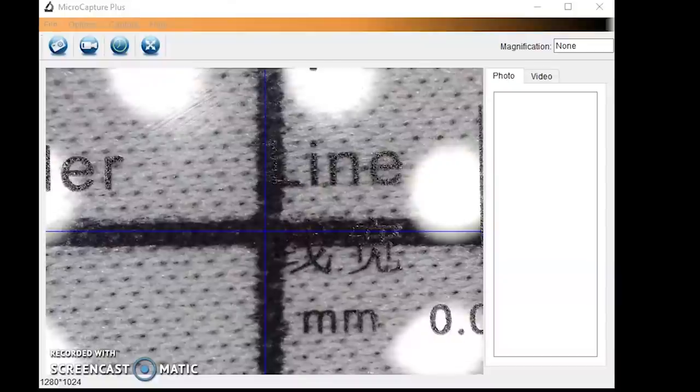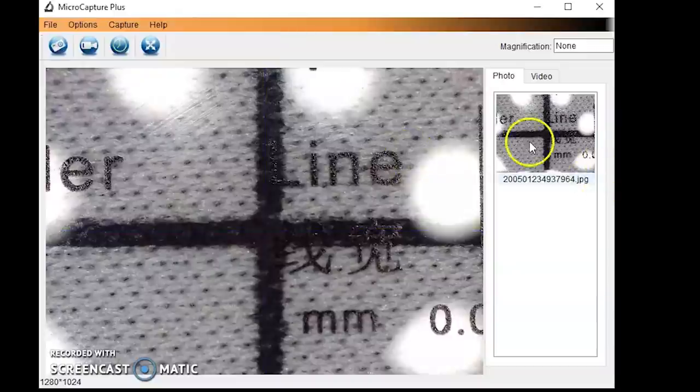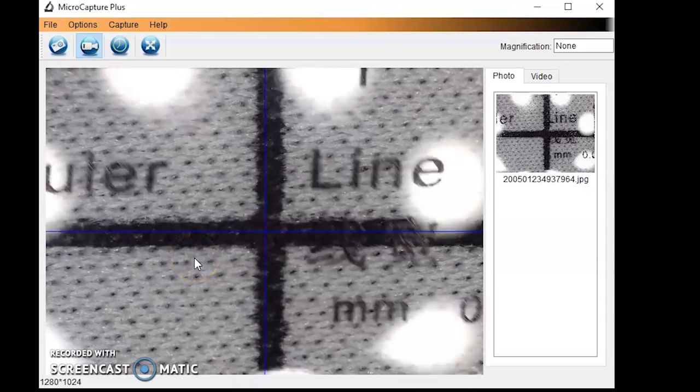As far as the software is concerned, I'll show you a little bit about how it works. Right here I have it set up, and as I go through here, you can see how well it magnifies. You're talking about a very tiny ruler that I have in place. I can take pictures and I can also record with it. When I record, it doesn't save it directly into the same area — you have to click on video to see where the video is. It saves in AVI format, which is usable if you want to create videos.